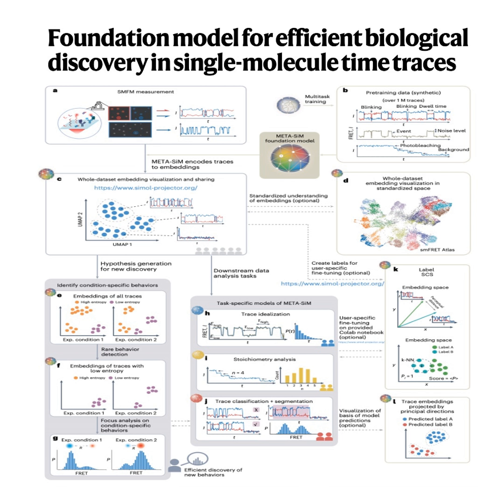How does it project them? Those vectors are high-dimensional, right? We live in 3D. Exactly. It uses dimensionality reduction algorithms. You might have heard of techniques like UMAP or PCA or t-SNE. Vaguely. They squash high-dimensional data down. Right, that's the idea. Think of them as really smart mapping tools.